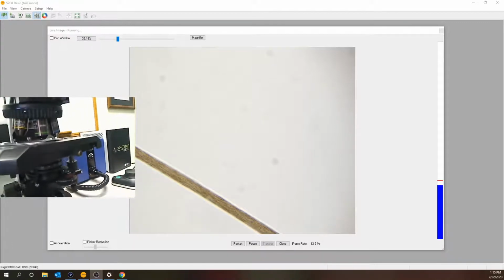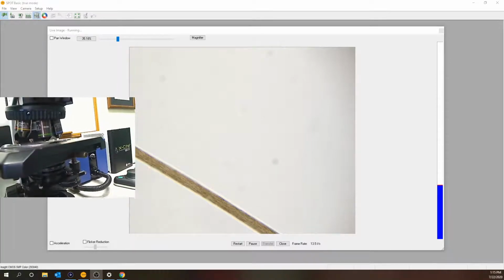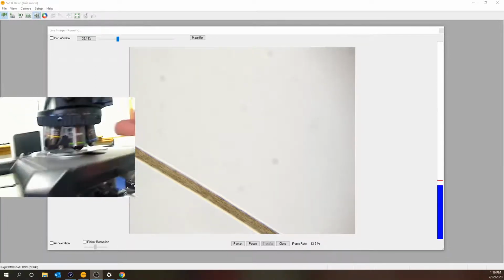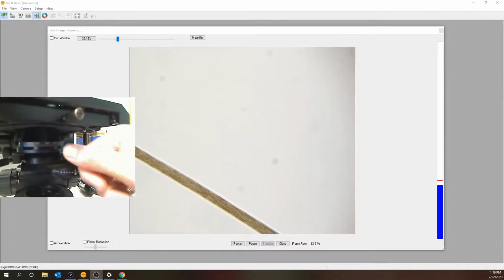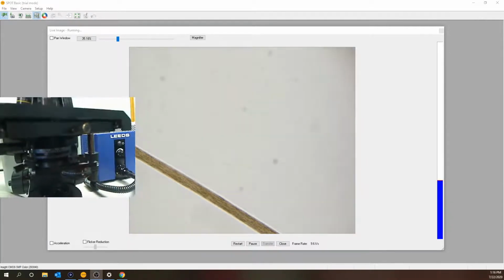So a quick tip you can use for just general imaging and work on an LCT is to look at the objective, what's printed at 0.3, go to your condenser, and then go 25% less of that. So just drop it down a little bit.